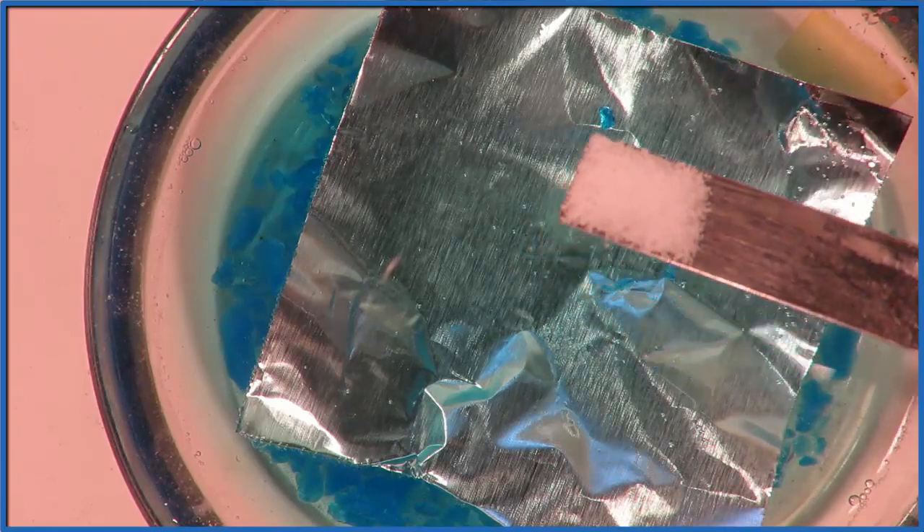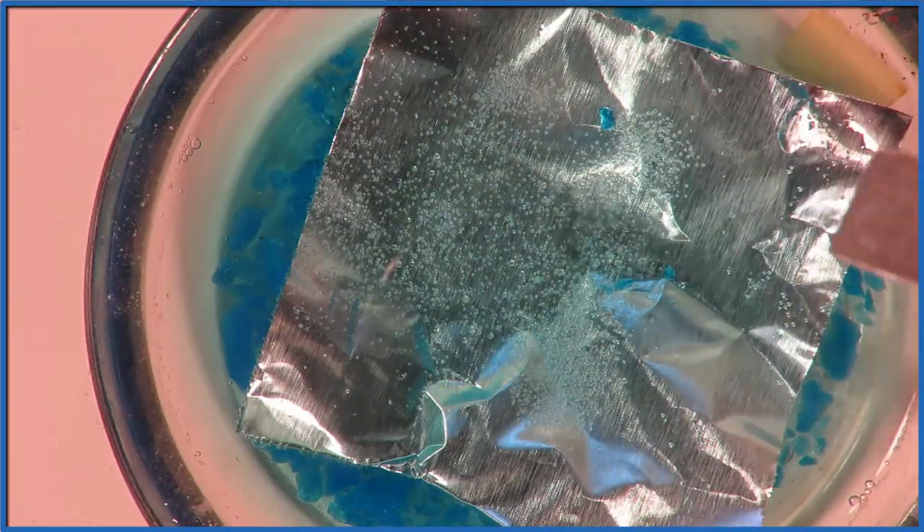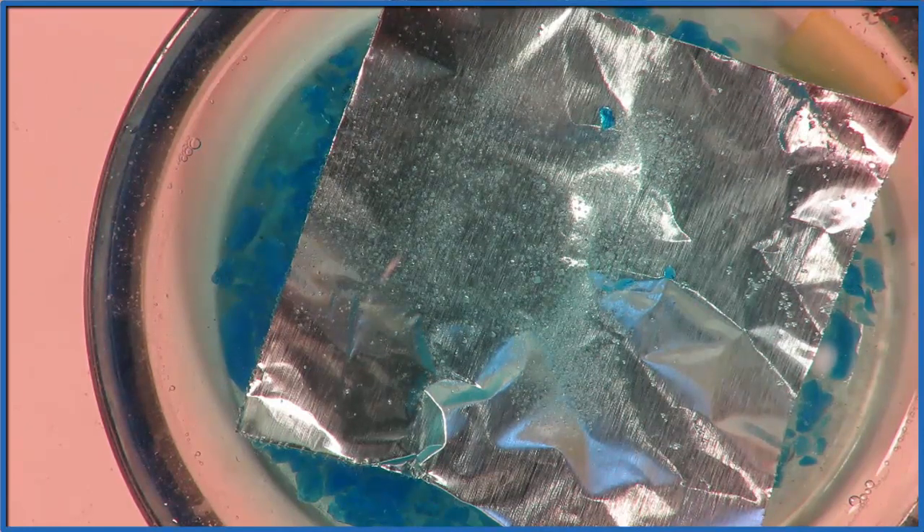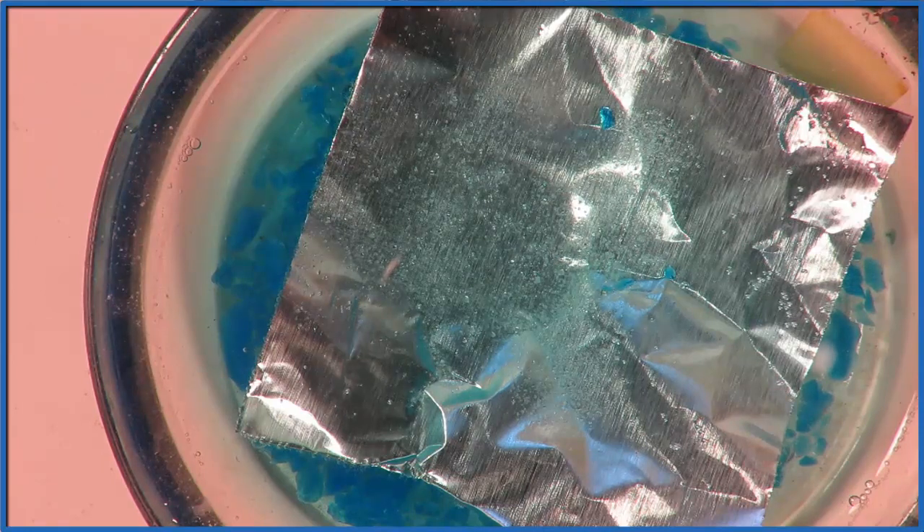Everything you see happening from here on out is going to be real time. This is actually how quick the reaction takes place. So we put the salt there, and that starts dissolving into the Na+ and the Cl-, the sodium and then the chloride ion, and immediately you see some bubbles are starting to form.